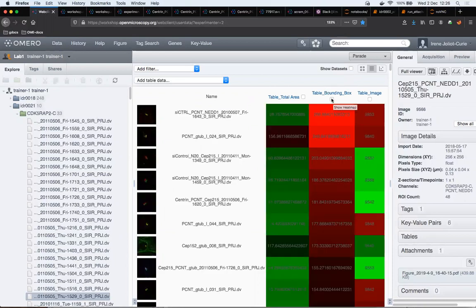Peter, sorry, can you show again how to add more filter? Christina missed that. Yes, so I am adding filter. Okay, so for example, I can filter for. You're in the middle tab already. Is it? Or you just? Yeah, continue. Sorry. So filter addition is here, okay?